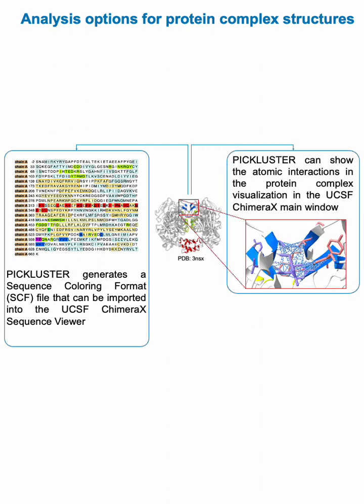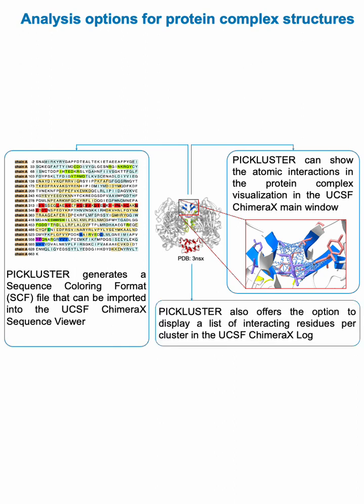A second option is that PICKLUSTER can show the atomic interactions in the protein interface in the UCSF ChimeraX main window. This option offers a more detailed view into the interface. Moreover, PICKLUSTER also offers the option to display a list of interacting residues per cluster in the UCSF ChimeraX log instead of just showing the residues in the interface.